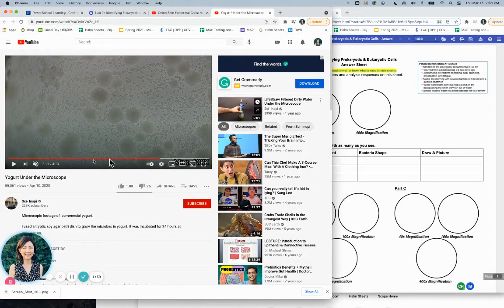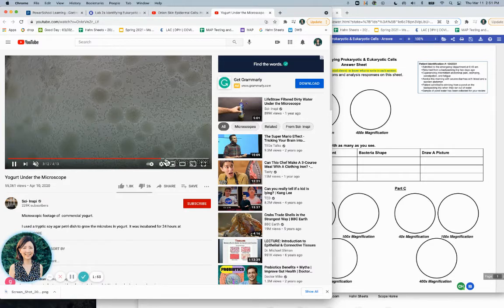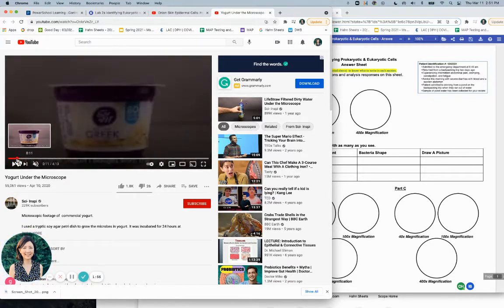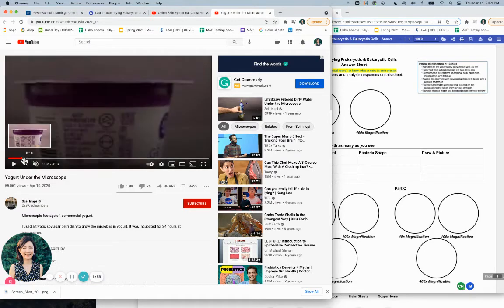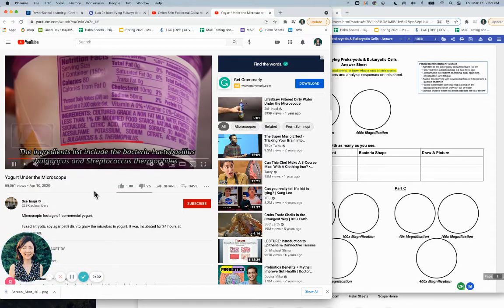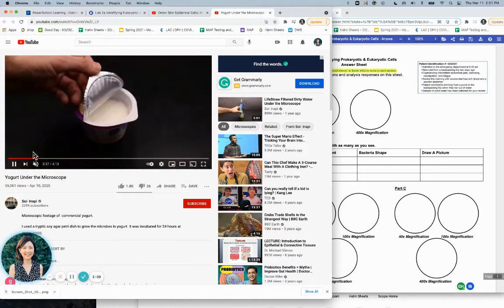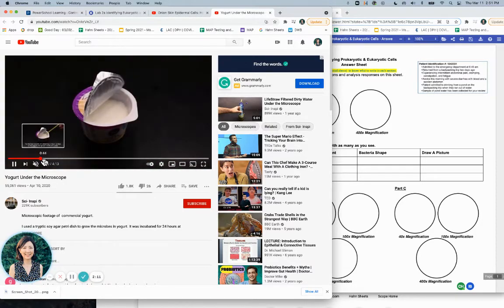I like to play things at a higher speed, including my own videos. So if you feel like I'm talking too slow, you can always speed it up. But what you want to do is watch this person, see what exactly they're getting the sample from. So regular yogurt, if you look, you can see that there's bacteria cultures in there.